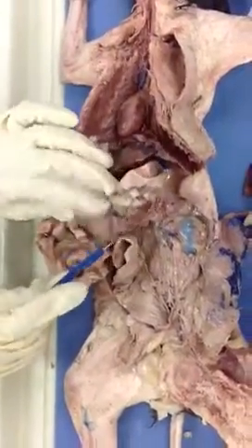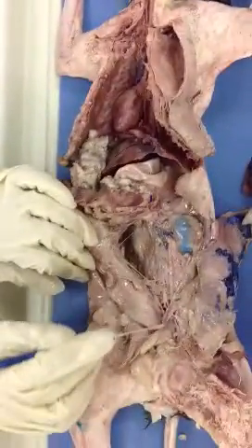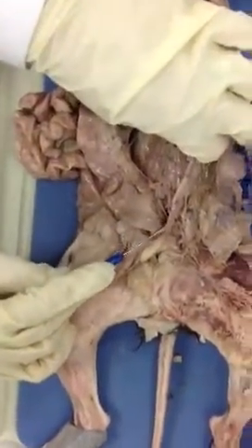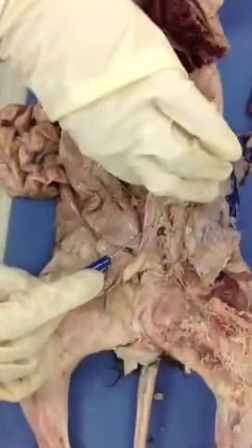Now, if you notice, the spleen and the stomach are intimately related because they're anchored by a ligament. What's the name of that ligament? Gastrosplenic. Very good. Now, we continue our journey and encountered another structure. What structure is this, please? Round ligament, and then this one that goes perpendicular is called the broad.